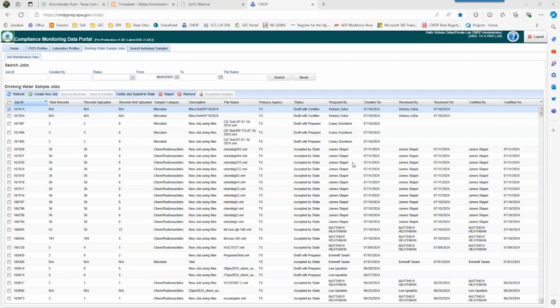All right. So another question is, do we have to enter each sample one at a time? I think the answer is in the web form. Yes. And the Excel template, which we'll show in a bit, lets you enter more than one. And then will this replace the EDD reporting? I'm thinking yes, Garrett? Yes, it will.